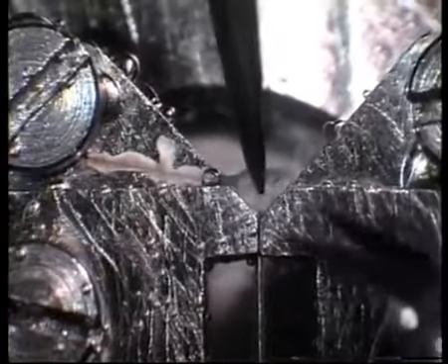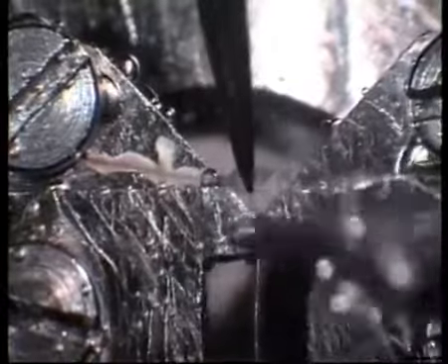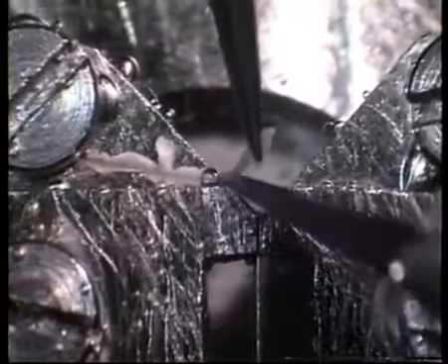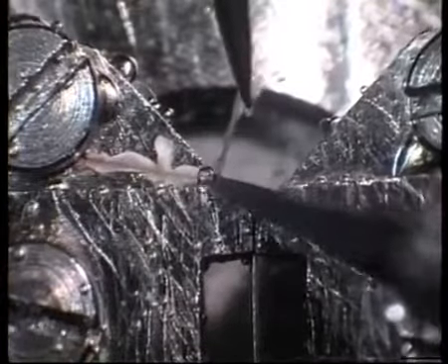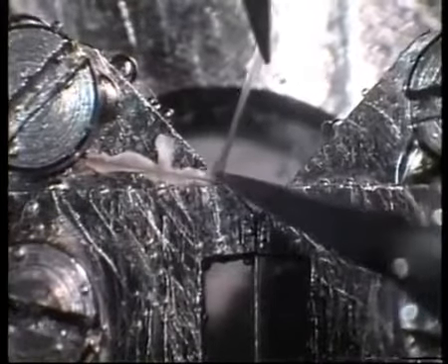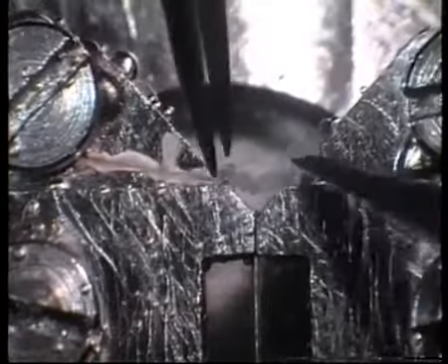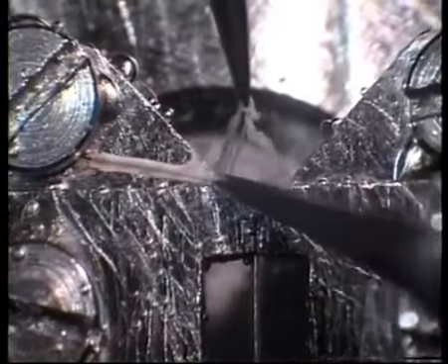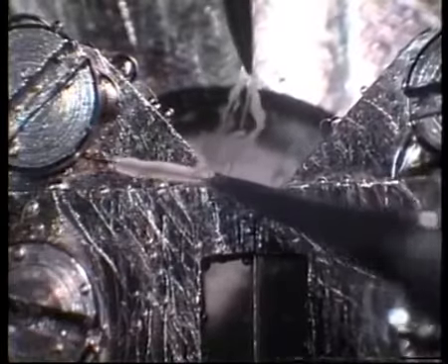You can see that the excess tissue is rubbed and thereby freed away. The excess tissue can be left in place or can be cut away, as shown here. This method has the disadvantage that there will be quite a lot of tissue left at the top of the jaw, and if that is not dealt with, it will substantially affect the normalization.